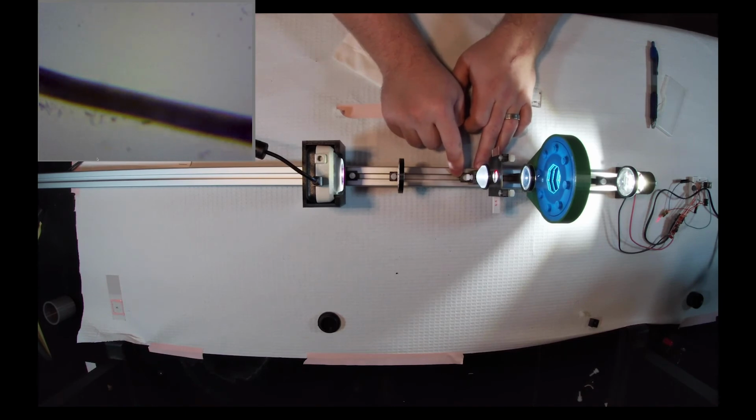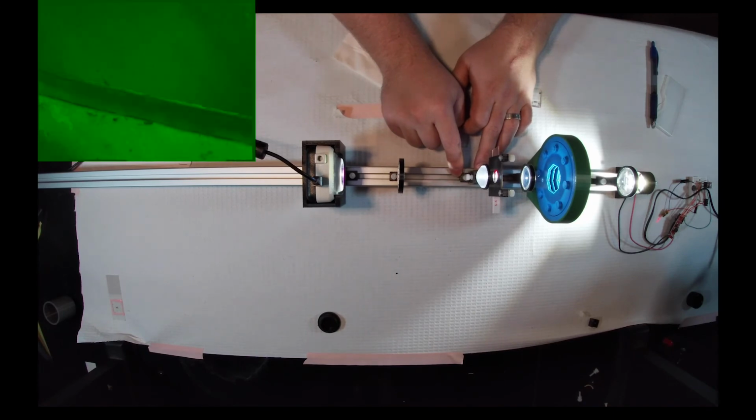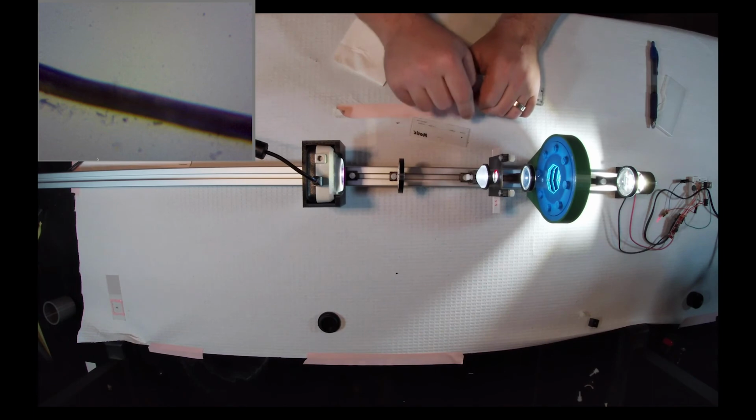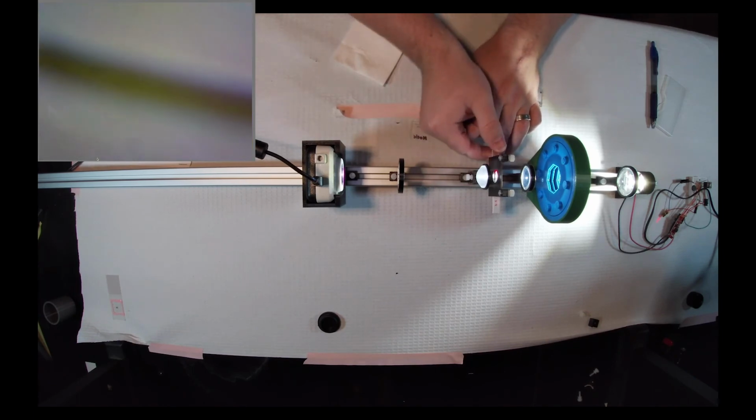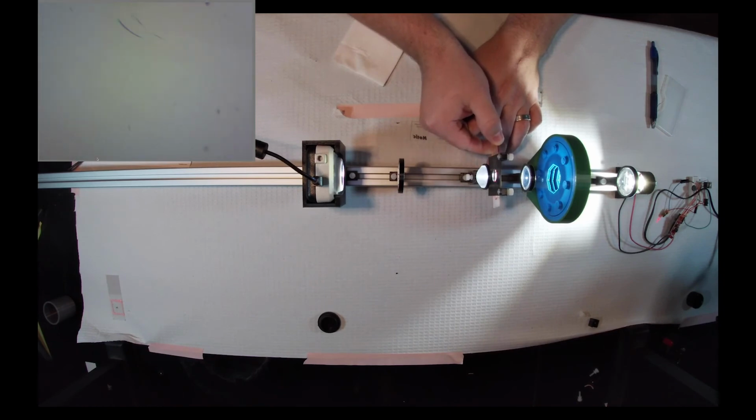The hair in this case looks quite a bit darker than the background because compared to the water, even the small amount of melanin in my hair absorbs quite a bit of that light and looks pretty dark compared to everything else.